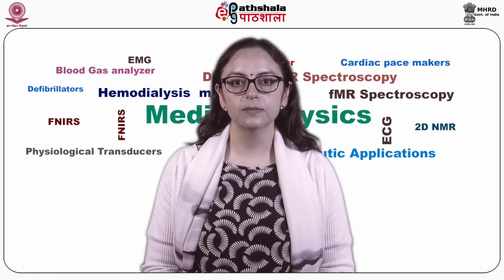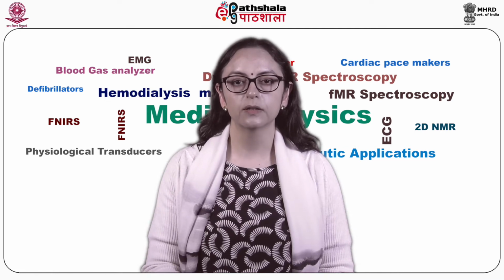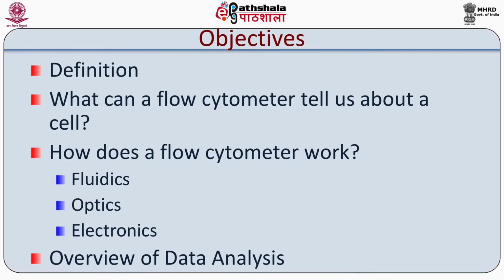At the end of this module, we will learn the following. What is flow cytometry? What can a flow cytometer tell us about a cell? How does a flow cytometer work? Its different systems, the fluidics, optics, electronics, and we will conclude by an overview of data analysis.